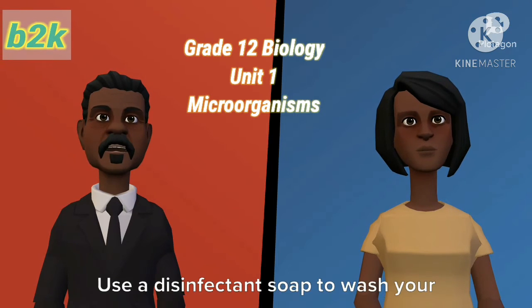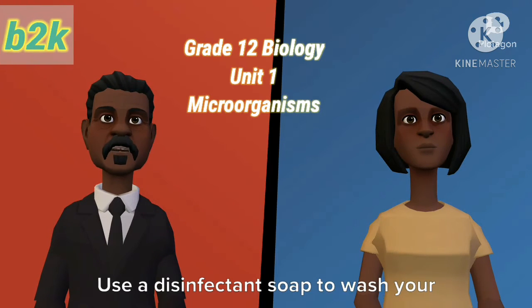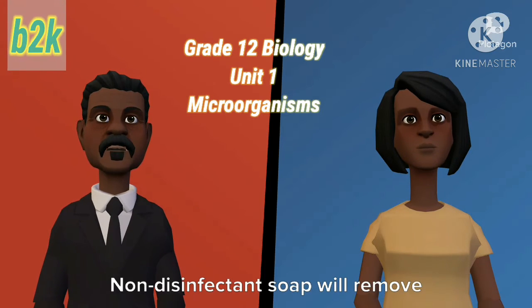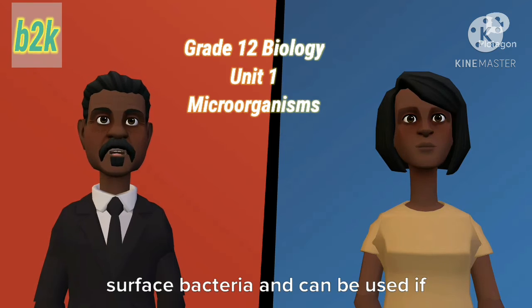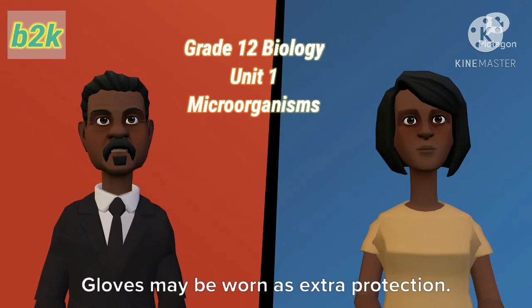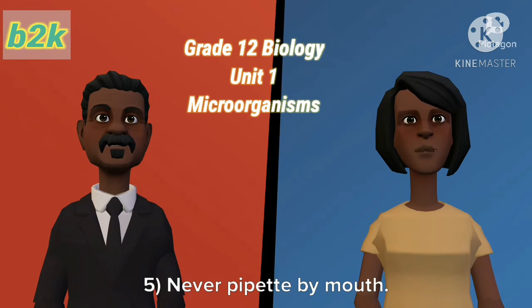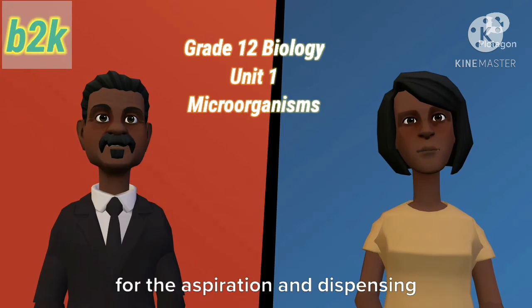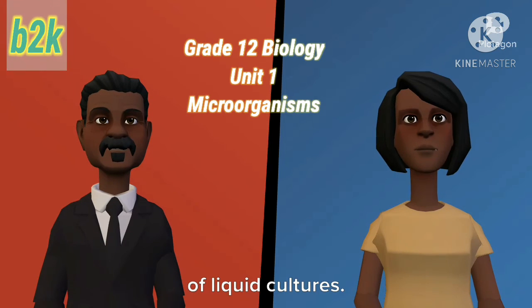4. Wash your hands. Use a disinfectant soap to wash your hands before and after working with microorganisms. Non-disinfectant soap will remove surface bacteria and can be used if disinfectant soap is not available. Gloves may be worn as extra protection. 5. Never pipette by mouth. Use pipette bulbs or pipetting devices for the aspiration and dispensing of liquid cultures.